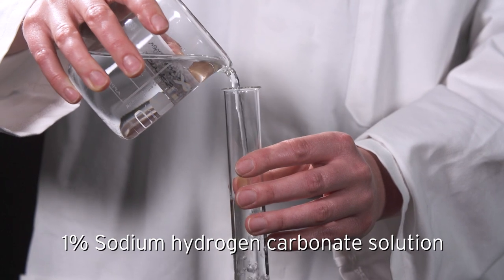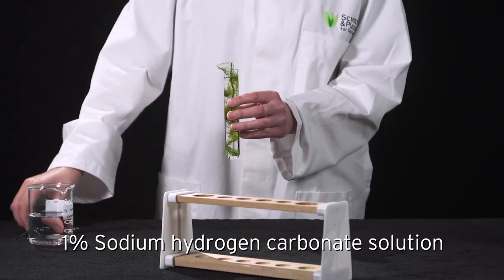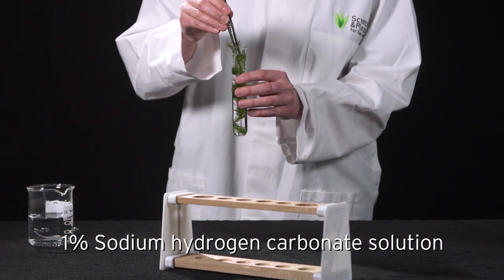Another rate limiting factor for photosynthesis, the availability of dissolved carbon dioxide in the water, can be eliminated by placing pondweed in a 1% sodium hydrogen carbonate solution that has also been allowed to come up to room temperature, instead of just water.